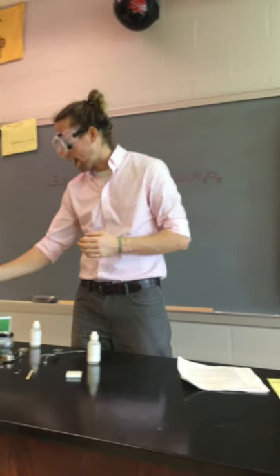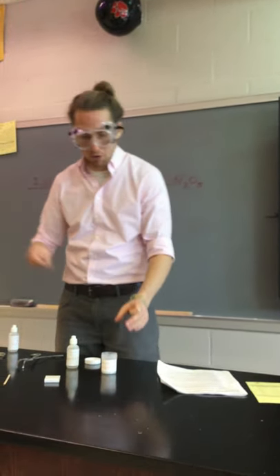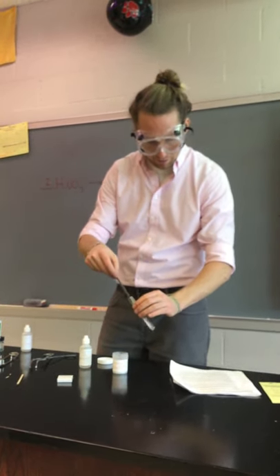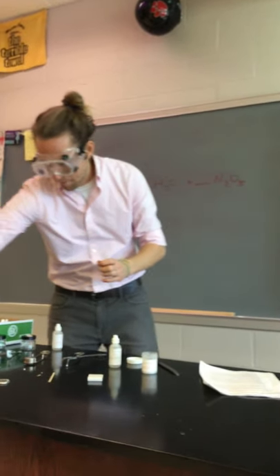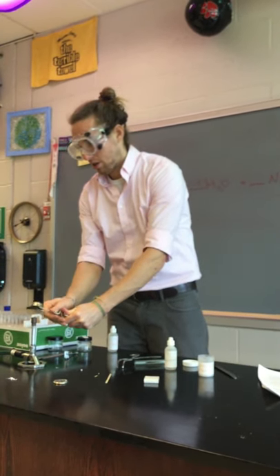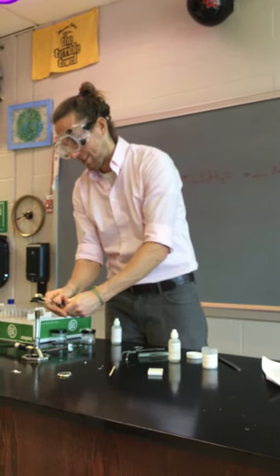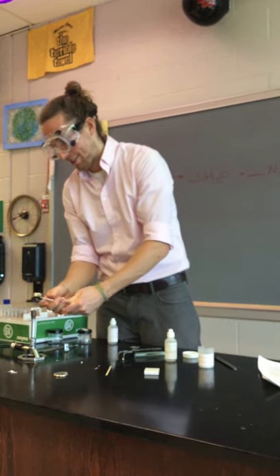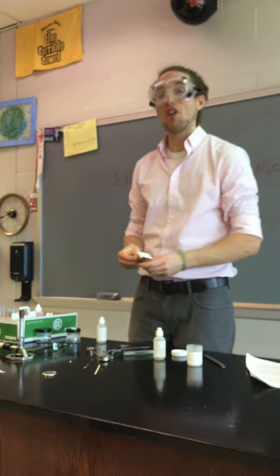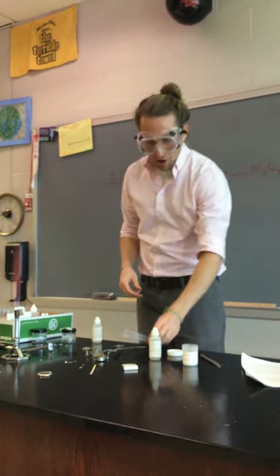Reaction number three requires a test tube. This time we're going to use something called ammonium carbonate. So I'm just going to take a very small scoop of ammonium carbonate with my spatula. We'll put that into the test tube. And we again need to heat this. So let me get my Bunsen burner back on. My striker is not the best. Now I know how you guys feel. All right, we're going to use a match. Even better.